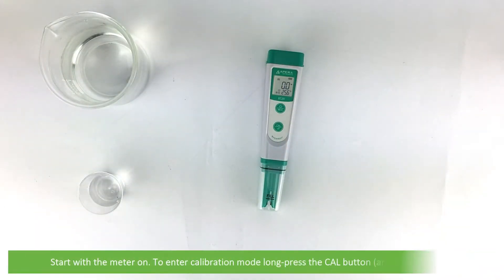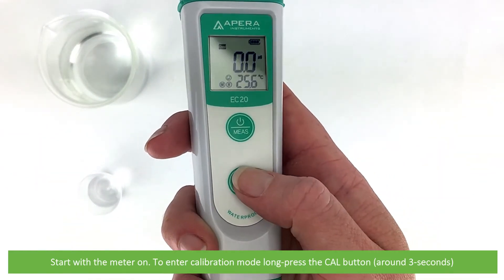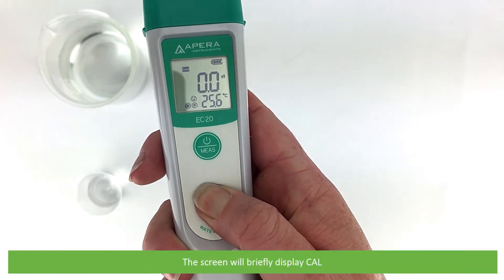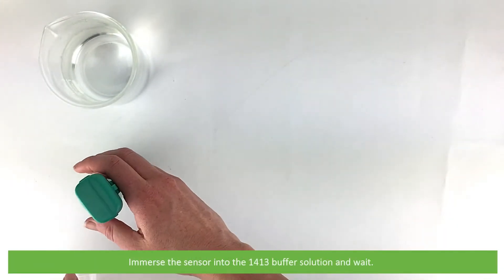Start with the meter switched on. To enter calibration mode, long press the CAL button for around 3 seconds. The screen will briefly display CAL. Immerse the sensor into the buffer solution and wait.